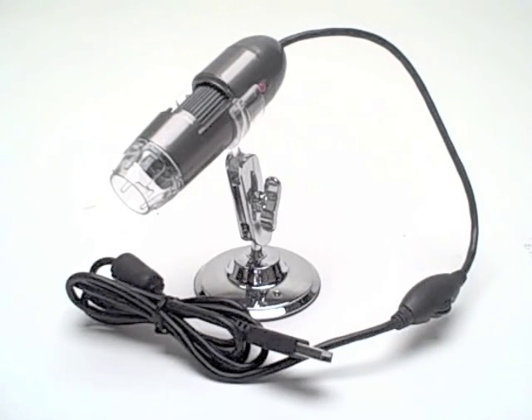The USB microscope comes with six different filters. You can see in 3D in both color and black and white. There's a reverse tone as well as red, blue, and green filters.